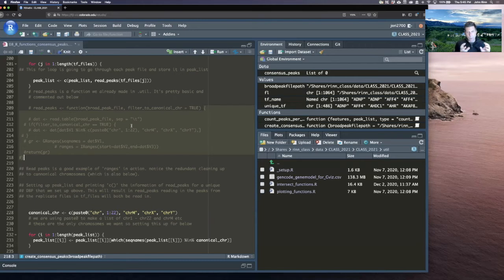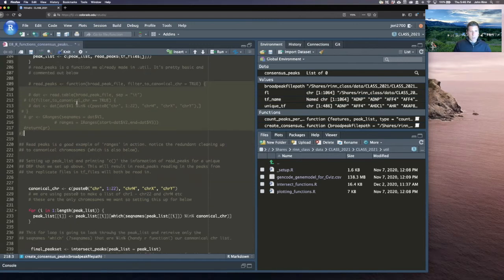So coordinates you can think of as a range, but a range is interesting because it's not only the start and stop of where those coordinates are. There are packages called genomic ranges that will also know what chromosome it's on. And that's important because if we had two coordinate intervals with start and stop, and they were on different chromosomes with the same numbers, that would just get too confusing. So that's really the main point of ranges, and we'll leave it for now. Please see the other video associated with this one, on a range and the chromosome association with that range of where the peak is.